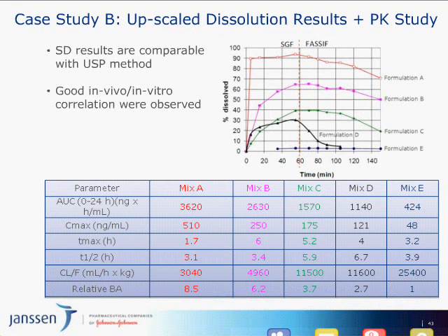Again, the first formulation was the hit we had over here. And further, if you look at the C, it was the HPMC on its own, which is a lower dissolution rate, and the API on its own, again, very low. So we can see that between the solid dispersion screen and the scale-up, we have very comparable results.